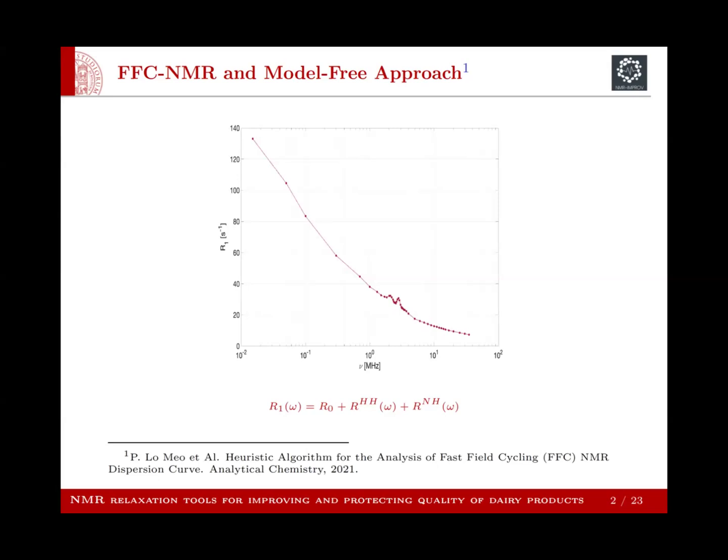But in complex systems, the evolution might present some local peaks, some local maxima. These are due to resonant phenomena, and could represent a difficult thing to fit with our software. So we started using a model for this kind of data.